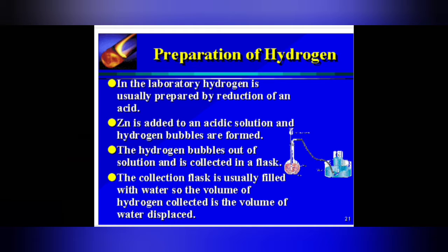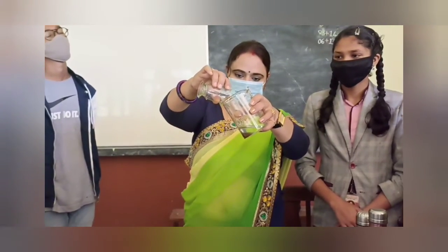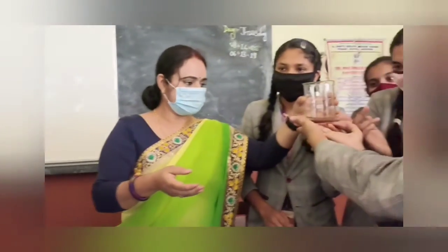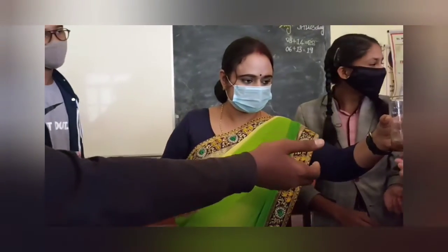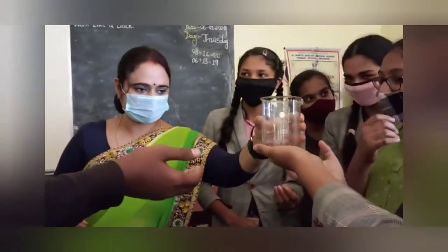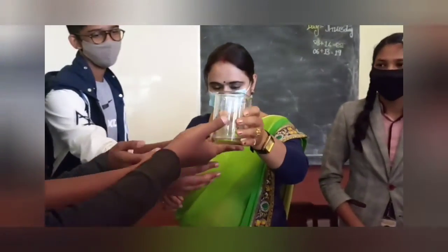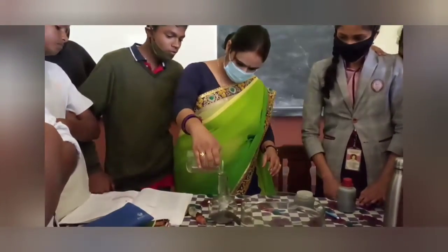As I got concentrated sulfuric acid, I am adding concentrated sulfuric acid into the water to make it dilute. As I am showing the students, this is an exothermic change — the beaker became hot. Now I am adding this diluted sulfuric acid into the zinc granules.